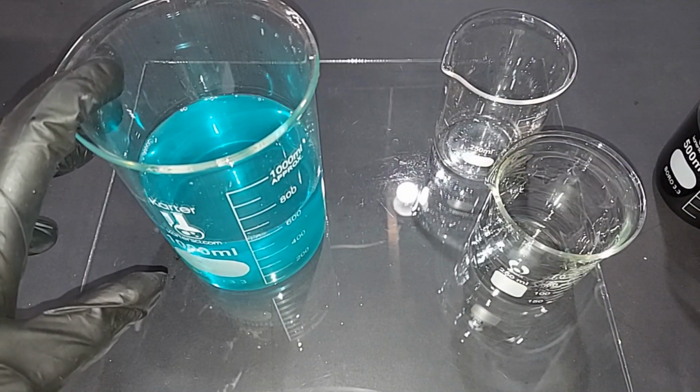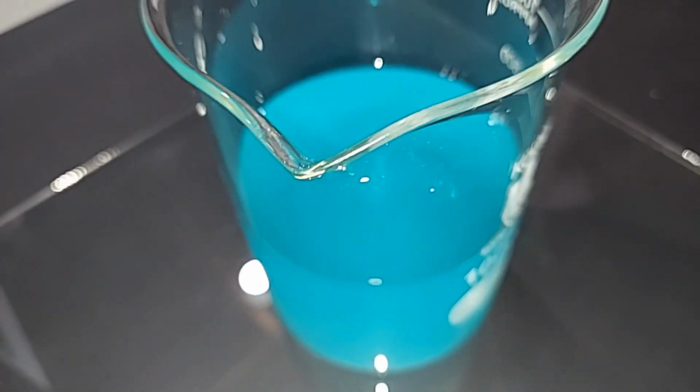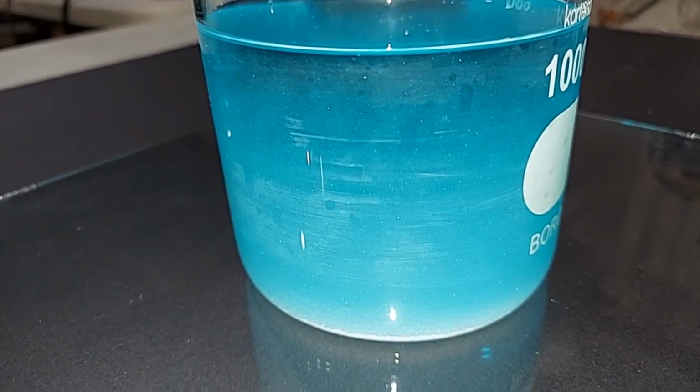Now that's it. That's it. This is not 2 minutes since I poured all the water in here. And we can see when we finally correctly drop the chlorine levels fast enough, all of the white fine copper 1 chloride that's in here. It's even already starting to collect on the bottom. And you can see it separating from the top there. So eventually it will all end up at the bottom, and I'll be back then.